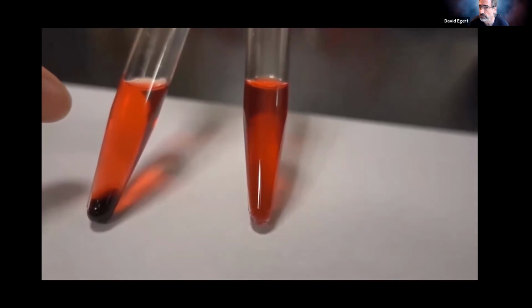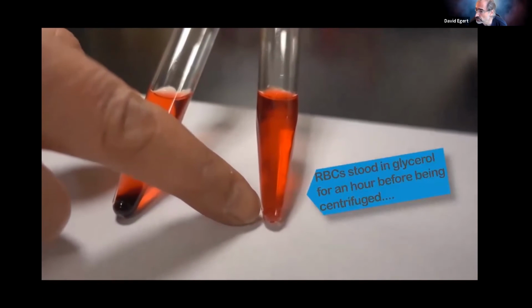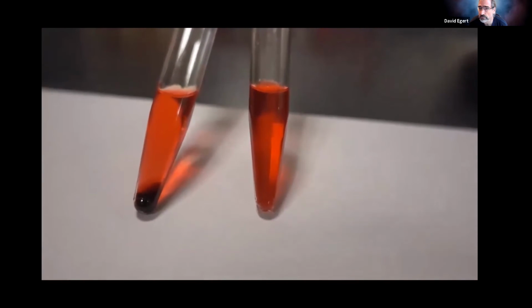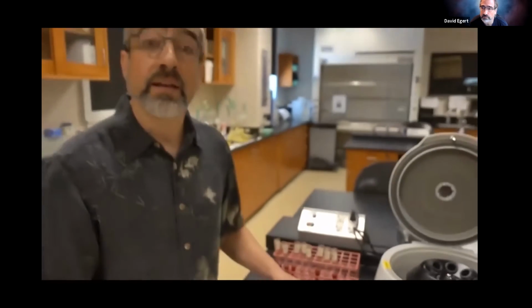Whereas in this one, where the cells sat in the glycerol for about an hour before we spun them down, there's no pellet, which is telling us that the longer you sit in the glycerol, the more likely you are to explode. And we're going to talk about that more in detail as well. So kind of why that happened and why that makes sense.